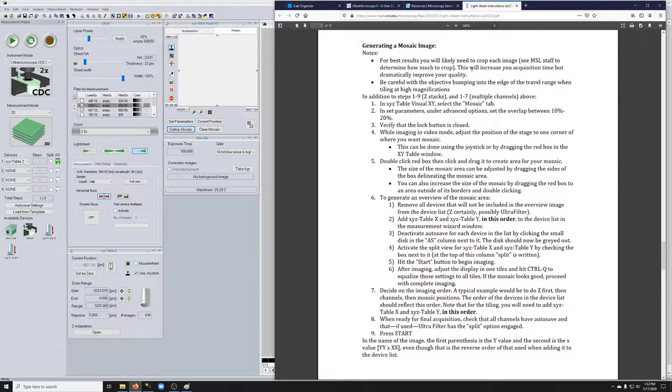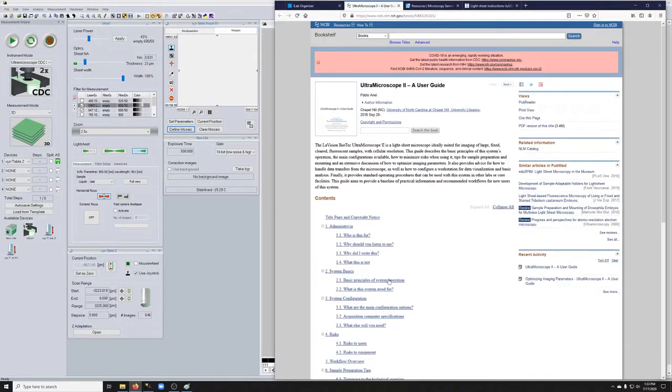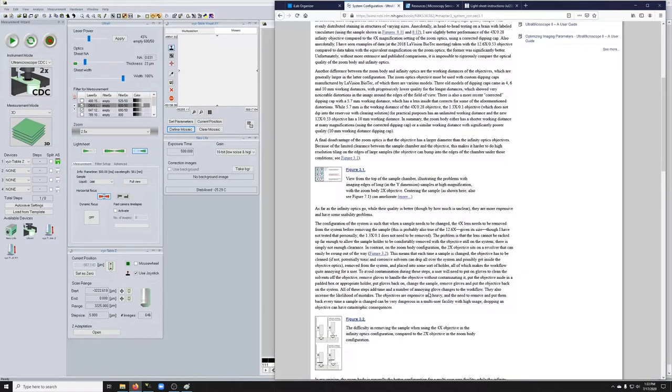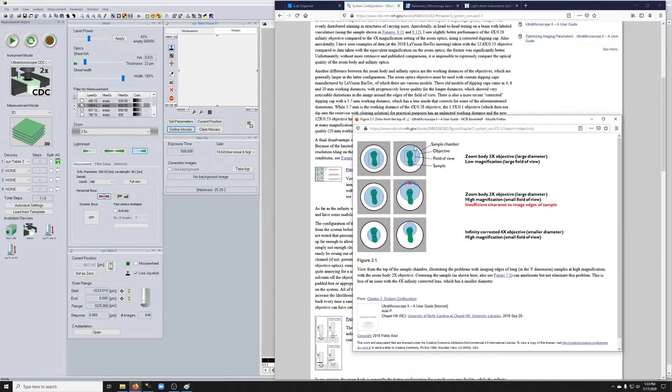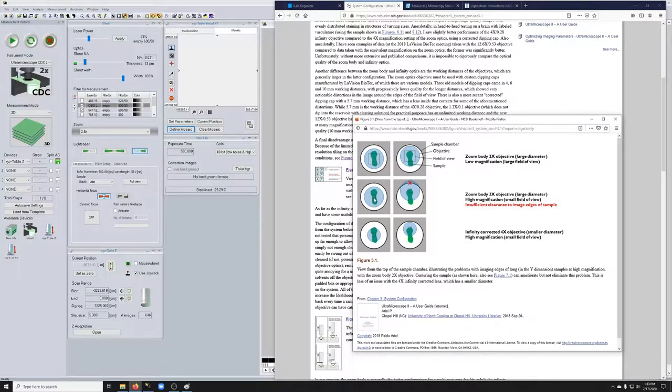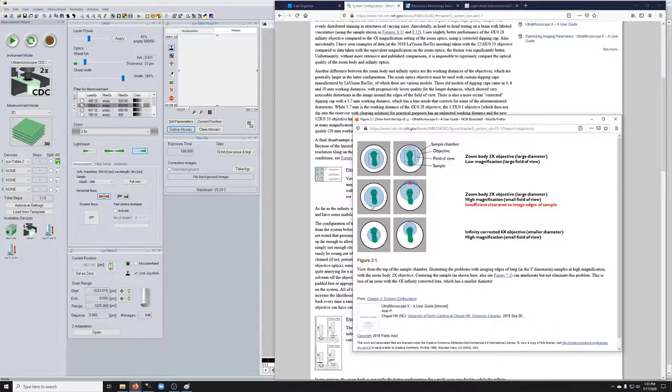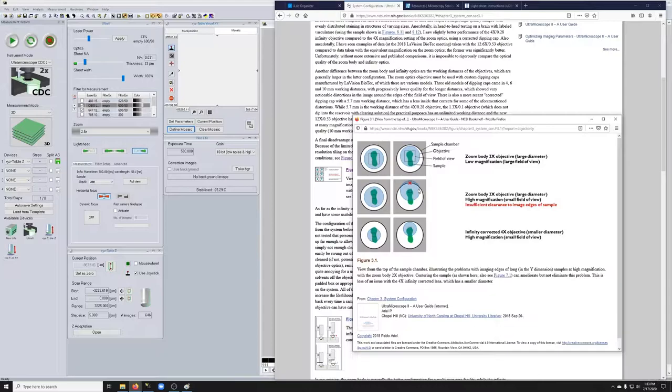So it says for best results, you'll likely need to crop each image, we've discussed that. Be careful with the objective bumping into the edge of the travel range when tiling at high magnifications. So if you have a situation where you want to take images at high magnification, so you're only seeing a small part of the field of view, and the white circle with this blob is what holds the sample, you can consider the blue circle the objective. So if you want to move to an edge of the sample, you may end up bumping into the edges of the hole in which the objective can move.